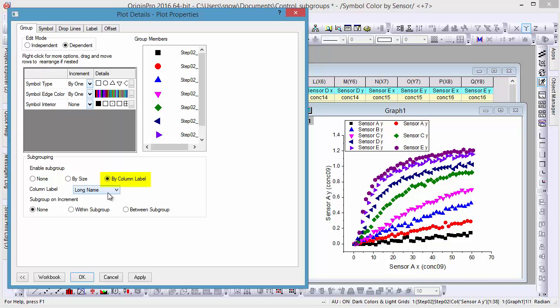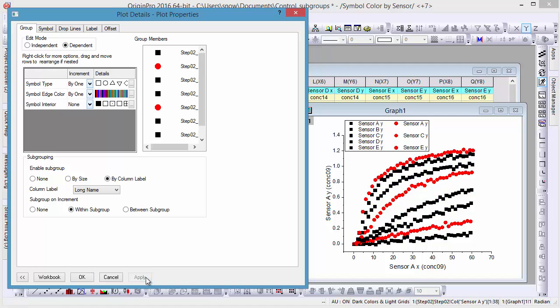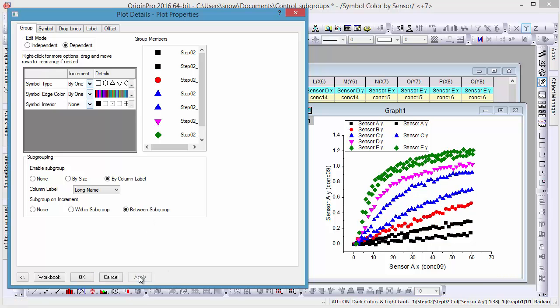If you choose within subgroup, symbol colors and types will increment within a subgroup. If you choose between subgroups, symbol colors and types will be the same within one group.